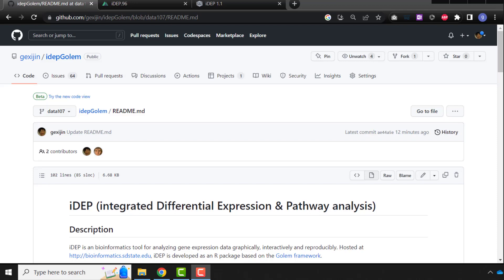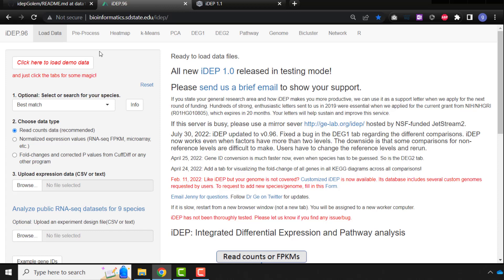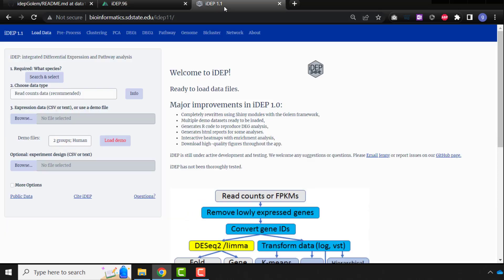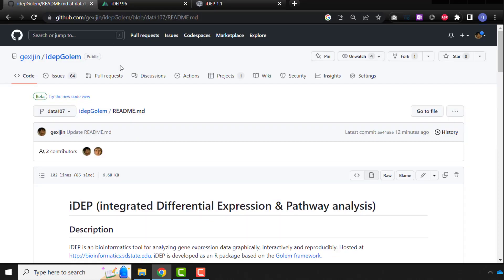In this video, I'm going to show you how to install iDEP locally. The older version of iDEP is a little bit hard to install locally because the database is big. The newer version, we break up the databases by different species. So we also rewrote the Shiny app as an R package. Everything is much easier now.